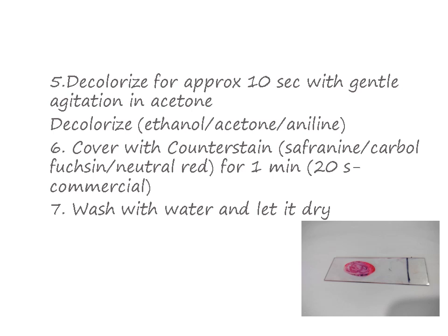Now once you have decolorized and washed it with water, cover the smear with counter stain. Counter stain you have to cover for 1 minute. If you are using any commercial kit, then you have to look into the literature. They have specific time frames, you have to follow them, otherwise it is 1 minute. Then again let it wash and let it air dry.